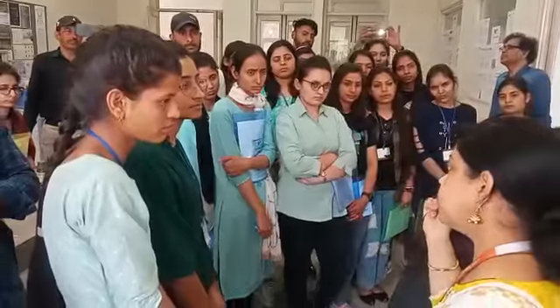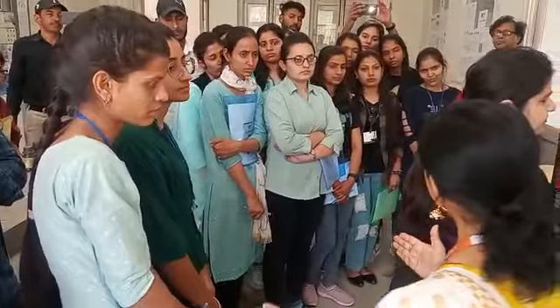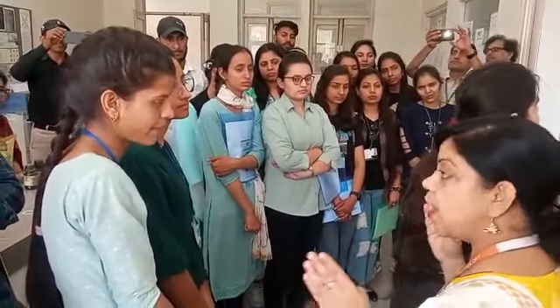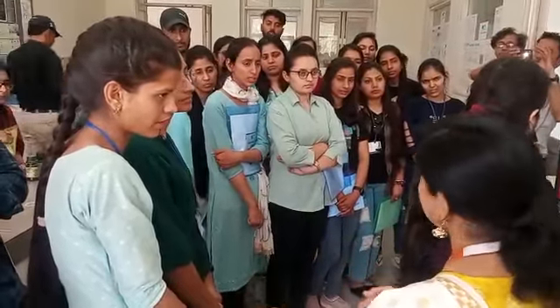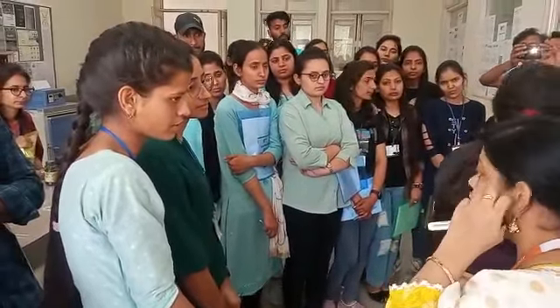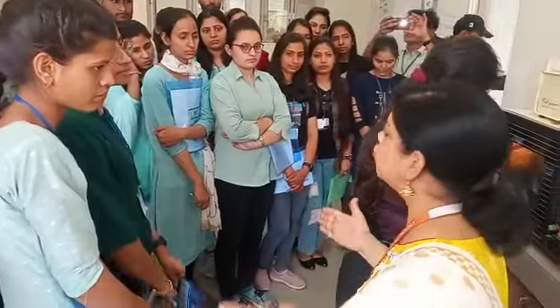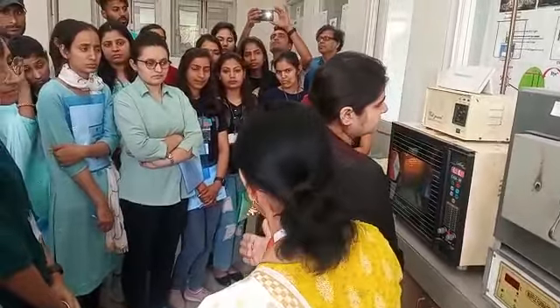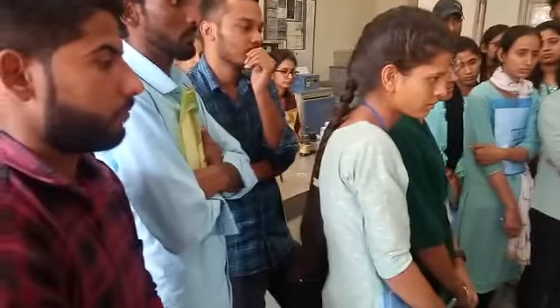What do you mean by RF? Distance traveled by solute upon distance traveled by solvent. As a solvent, we are using a mixture of benzene and ethyl acetate, or you can also use different percentages of benzene ethyl acetate. 50-50%. You can use benzene ethyl acetate in 80-20%. Okay, you can change the ratio. This is your solvent medium.